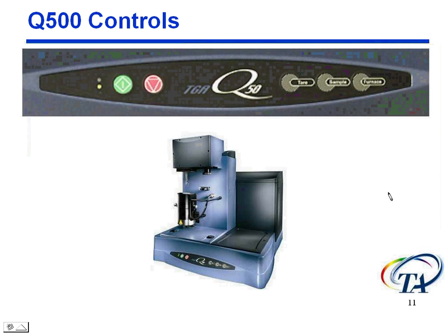If we look at a Q50 control, it doesn't have the display panel, but what it's got is this pad right here that's blown up here.